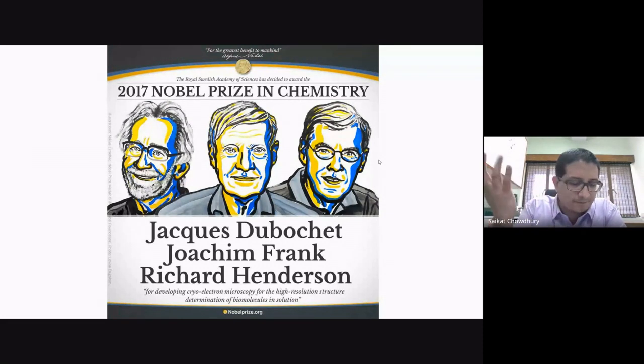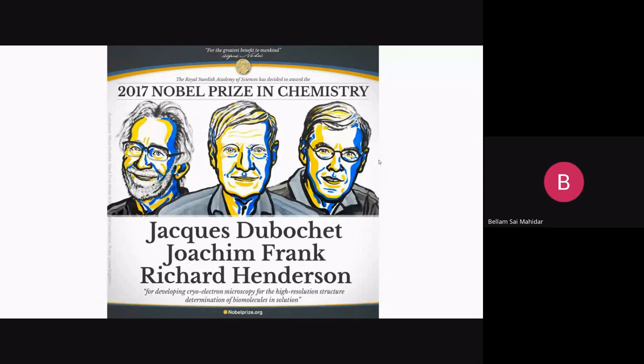when almost recently in the last almost 6-7 years to a decade, cryo-EM has revolutionized the field of structural biology, not only in allowing us to tackle problems which otherwise we couldn't have thought about in crystallography because of the sheer size and flexibility and also the complexity. And also we are reaching a level of resolution where we can easily figure out how these things work.